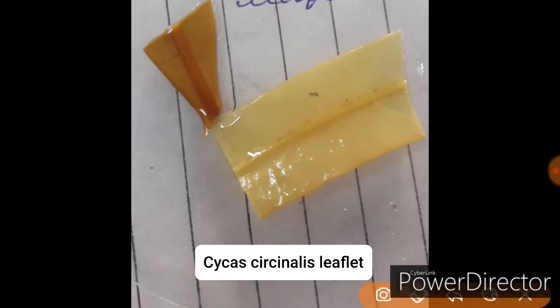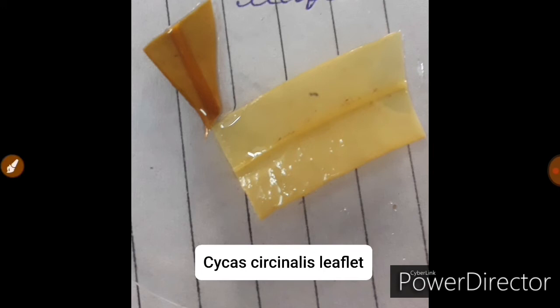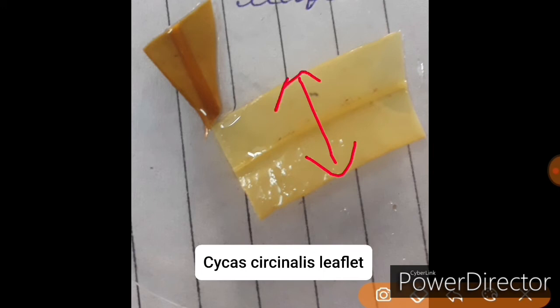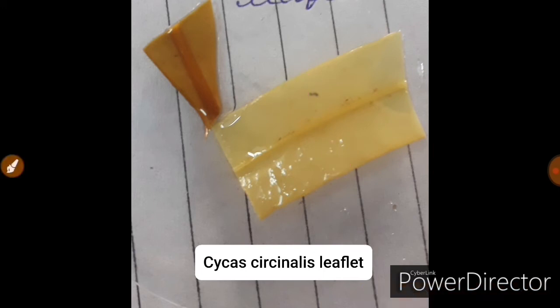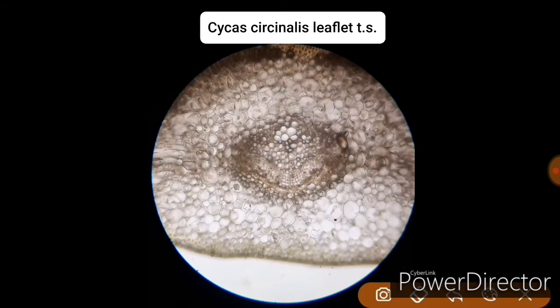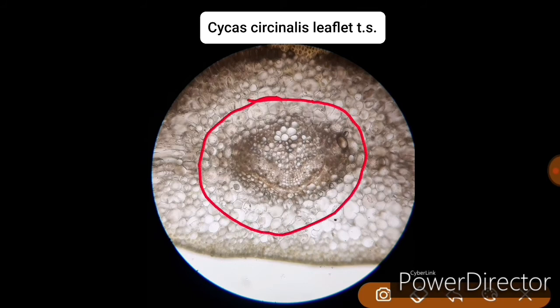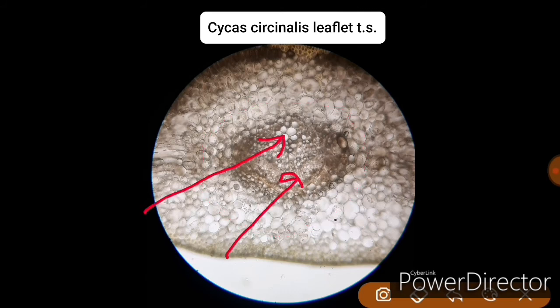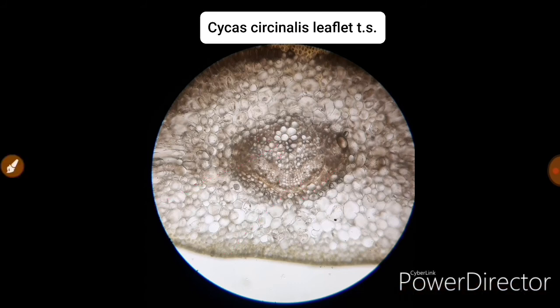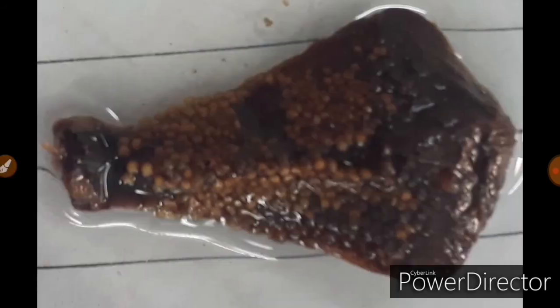This is a Cycas circinalis leaflet — as you can see, it is slightly wider compared to the Cycas revoluta leaflet. The Cycas revoluta leaflet is less in width, while the Cycas circinalis leaflet is much wider. The major difference in the section is that Cycas circinalis leaflet has straight margins, while Cycas revoluta has curved margins. This is the transverse section of the Cycas circinalis leaflet showing the bundle sheath region with centripetal xylem, centrifugal xylem, and phloem.